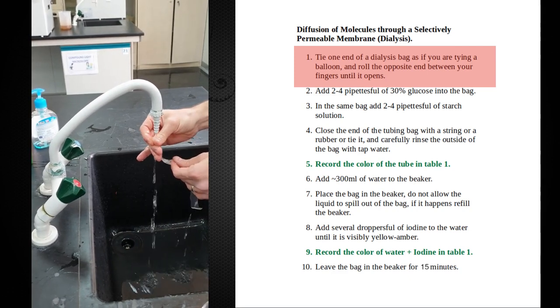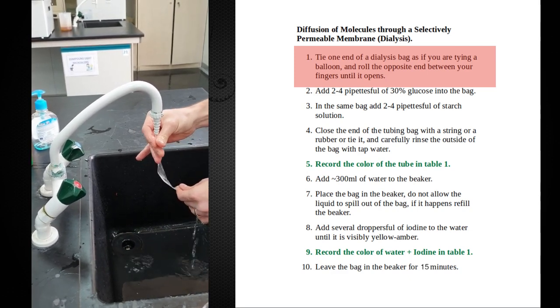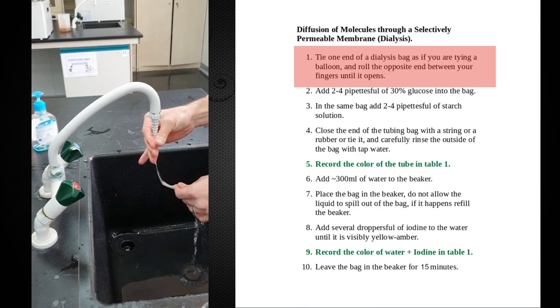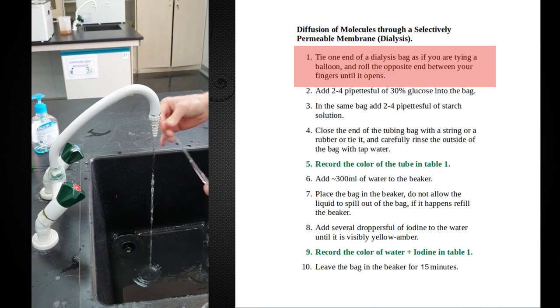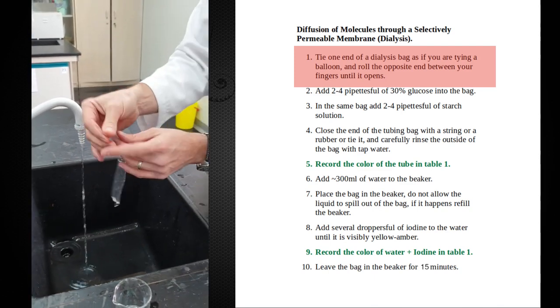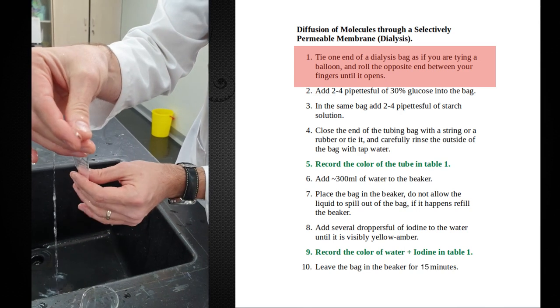Now you will always actually start by soaking this in some water or buffer. Some people will actually boil this before using it, just to ensure that it's not contaminated. So now we can see that this tubing is actually opening up.